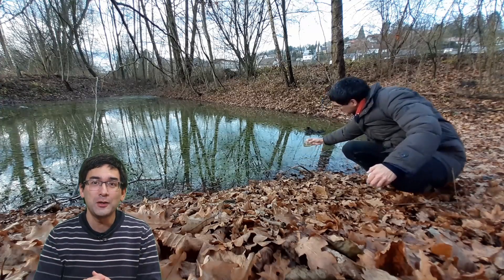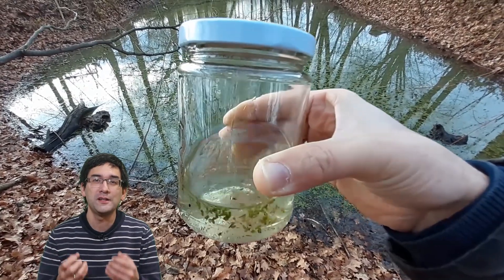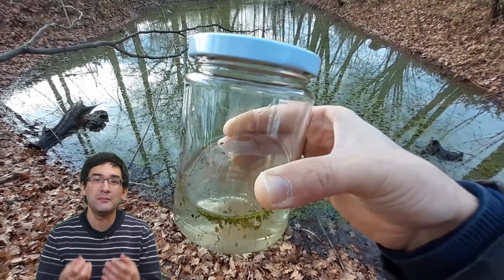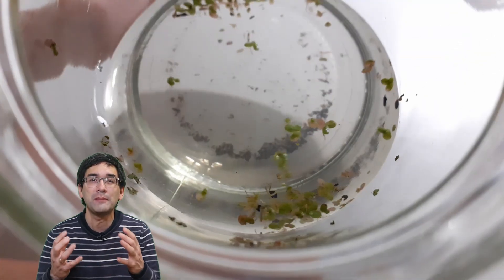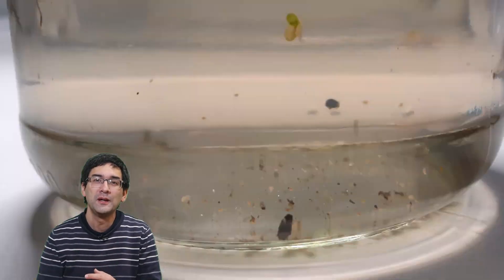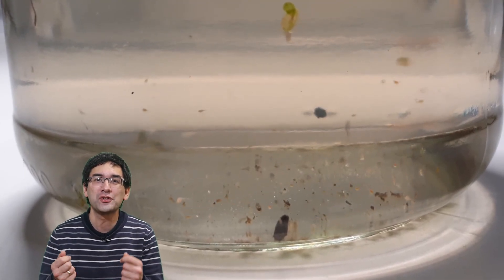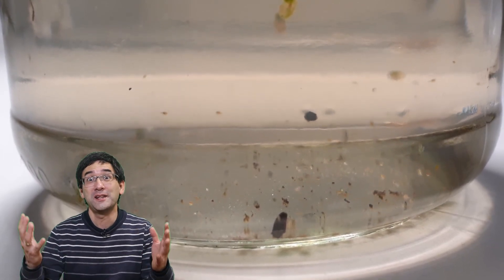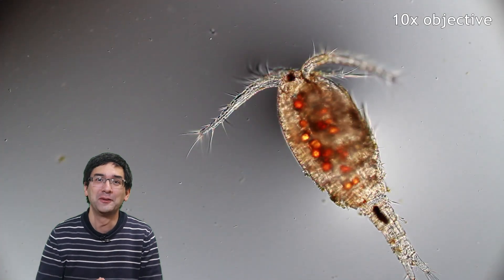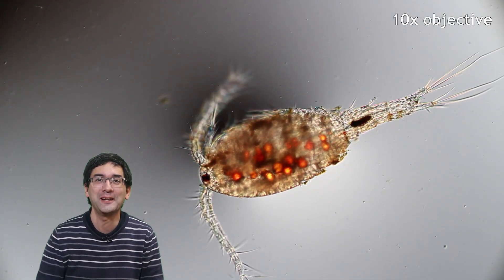To my surprise, however, the water was surprisingly clear — already a strong indicator that there are not many suspended particles or microorganisms in the water. At home I found out why: those little crustaceans had eaten up all of those microorganisms as a food source. So I said, okay, great — I'm just going to put those little critters under the microscope, and here they are.